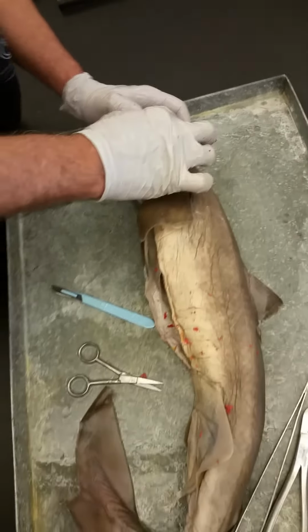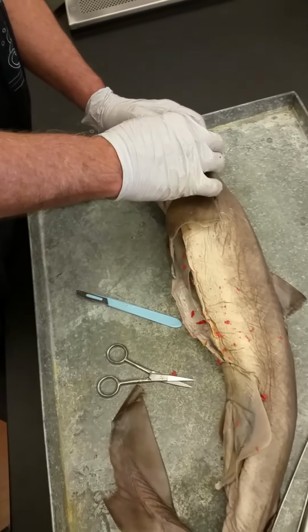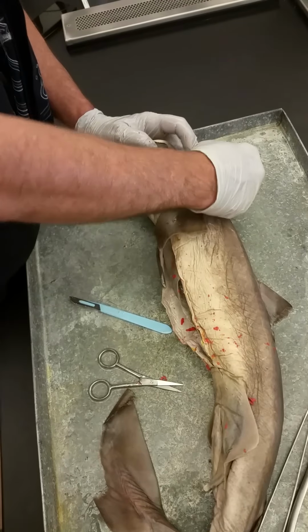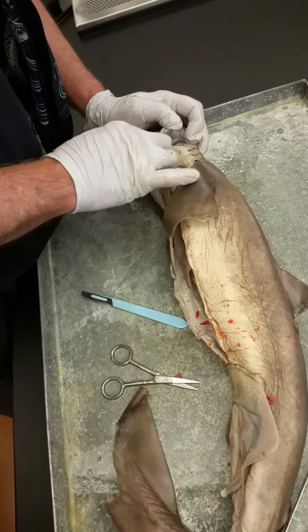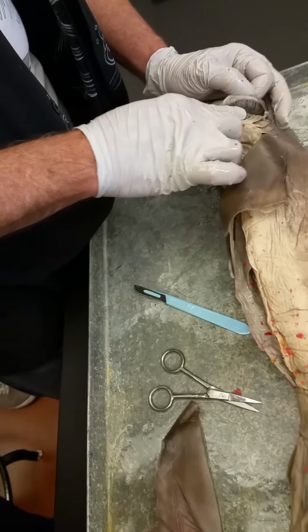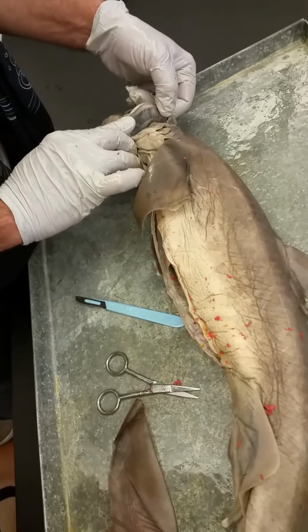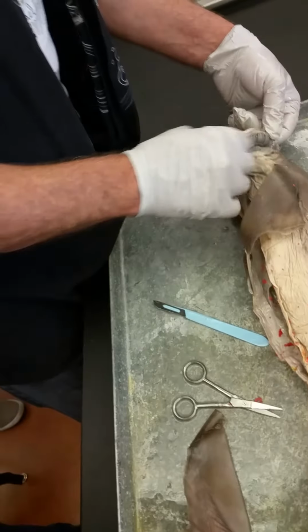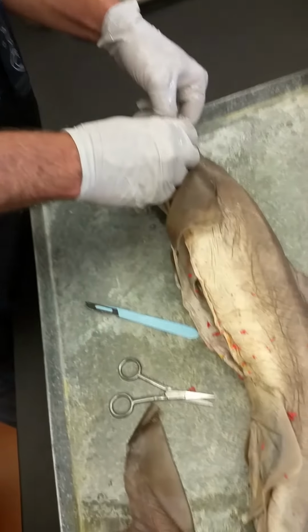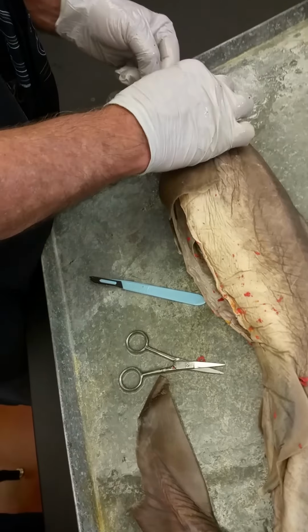You expect this to be red because it's vascular tissue, gas exchange tissue. But you see there's a couple of arches in each slit here. That looks like a mushroom. Yeah, the underside. Good thing they won't be on this exam, right? Mushrooms were on the last exam.